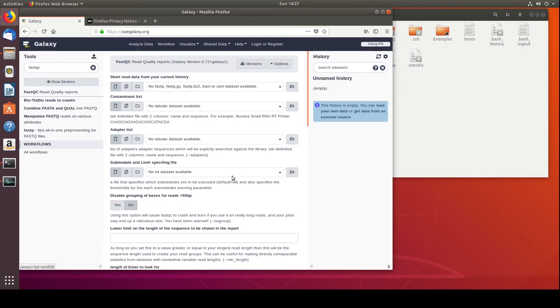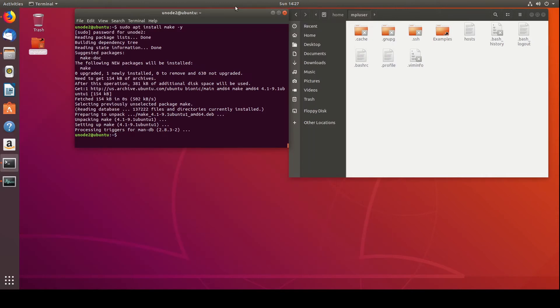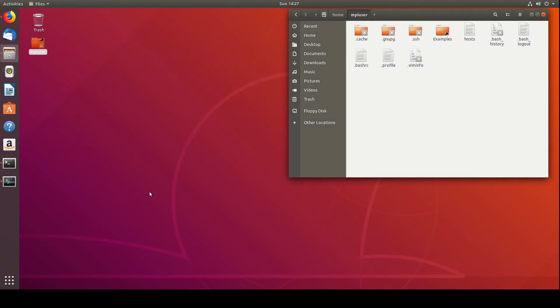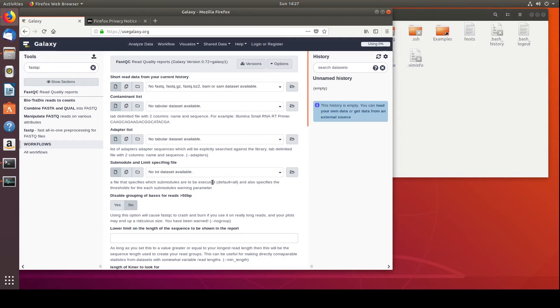I have tried to install it on Windows, so using the Windows subsystem for Linux, but as you can see, I'm running on Ubuntu today, and that's because when I was running it on Windows subsystem for Linux, I could get it to launch, but I would never actually be able to get an interface like this when typing in the URL that it provides, which is just the localhost URL. It would never come up on Windows, so I think it has something to do with how the Windows subsystem for Linux is partitioned out from the Windows operating system.